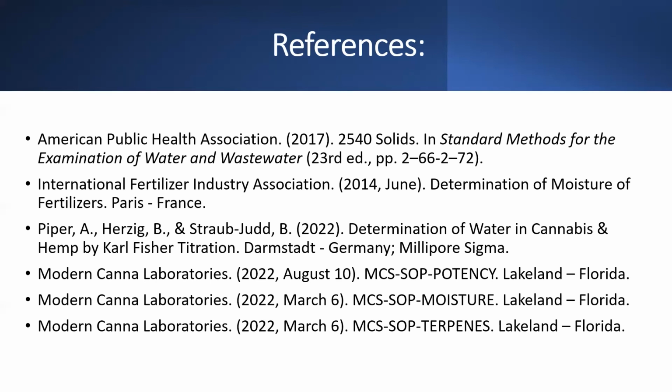That's great. Thanks, Jini. And the next question, which is probably on a lot of people's minds: if this method is proposed to be better for determining moisture content in cannabis, why is it not being used by a larger number of laboratories?